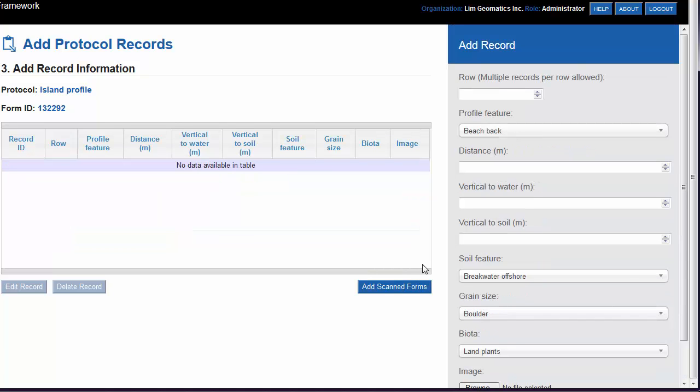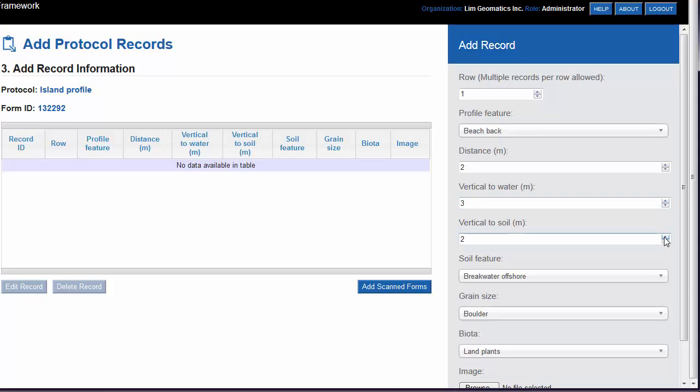You're now ready to add the record information. On the right-hand side is the Add Record panel. Complete the information in the list.